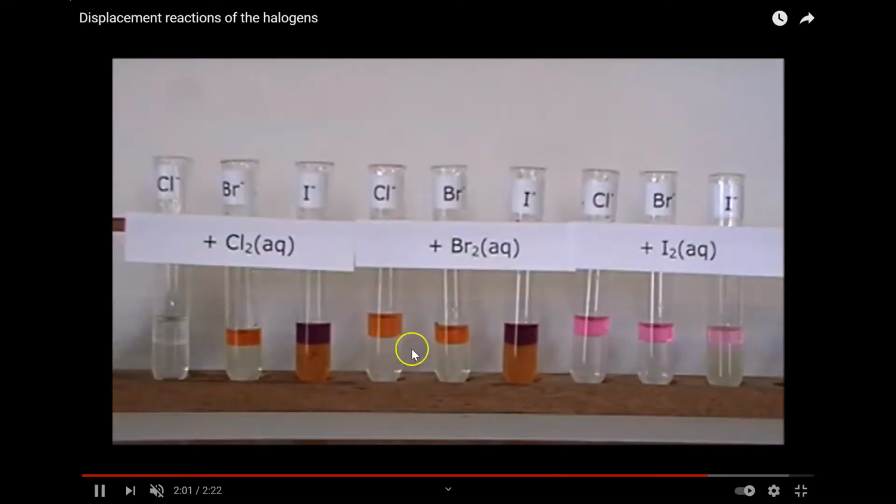So there you are. All right, so let's just pause that for a moment. What you want to see is that the chloride with the chlorine, that's your control. If you see that color in the top layer, that tells you that Cl2 is in the top layer. Okay? All right. Now here's your bromine with bromide, and it's this kind of orangey brown color. If you see that in the top layer, that tells you that you've got Br2 in the top layer.